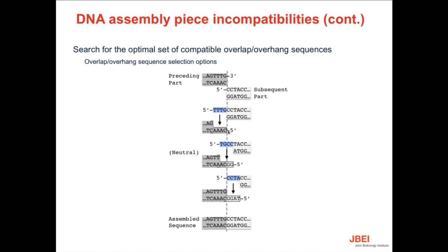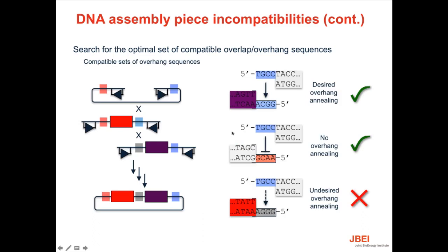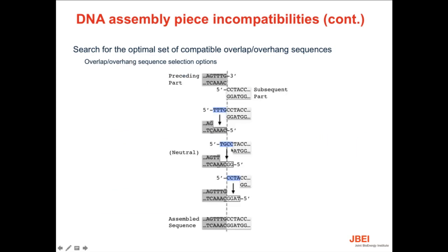And the other thing is, if you saw that with purely neutral overhangs or overlaps, you do get some incompatibilities between the overhangs that you've selected, all that you really need to do is start shifting the actual overhangs or overlaps until you look across all pairs of junctions, and everybody is only going together with who they should be going together with.